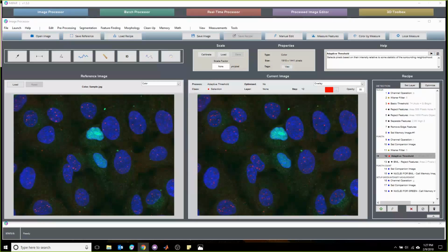So is there anything else that you wanted to add, or did you have any other questions from anything that we've covered today? You guys still getting along with it well at ISU? Yeah, no, it's been great. It's been a great help for really taking microstructures and being able to put quantifiable data onto them. And especially now we're able to batch process these images, so you're not limited by time. Once you have a recipe figured out, you just run it over your 100, 200 different images and get your quantifiable results.